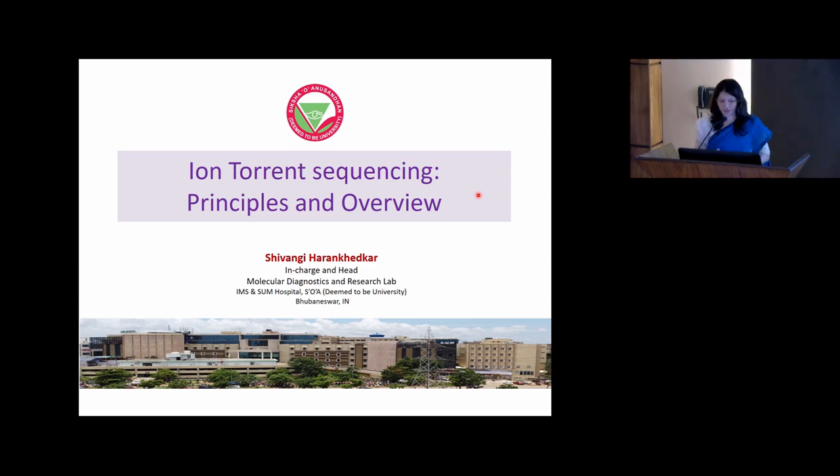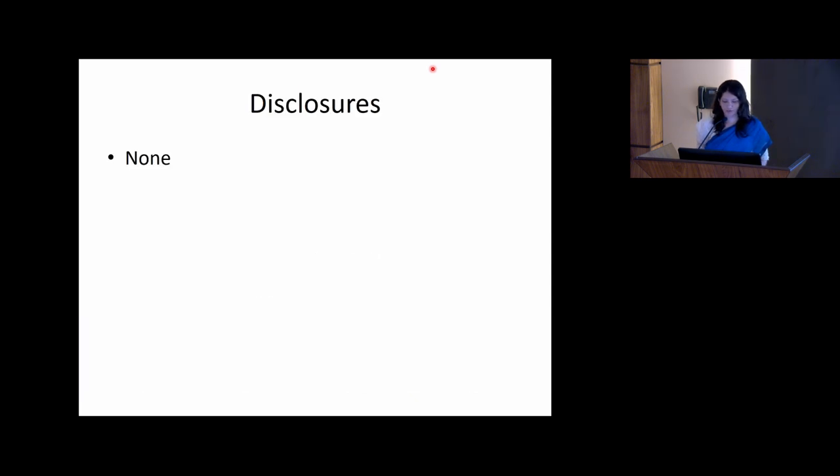Thank you. Good morning, everybody. I've been a student of this lab for 2 years, and it's like coming home. I'm really fortunate to be a part of this meeting. So the topic allotted to me is ion torrent sequencing principles and overview.